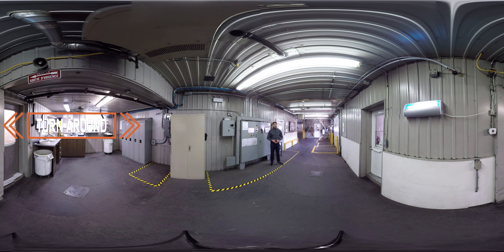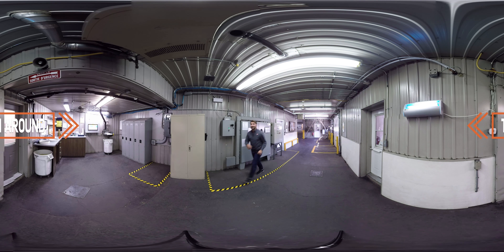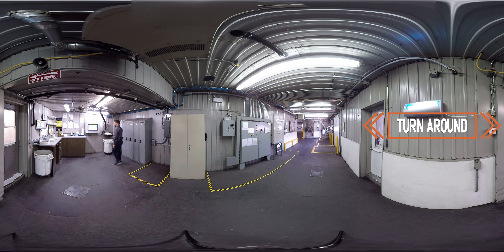During cleaning we do a quality test, and to make sure that our sample is representative, we use an automatic sampler. Then the selected bean comes out of this conveyor. It's time for a series of tests.